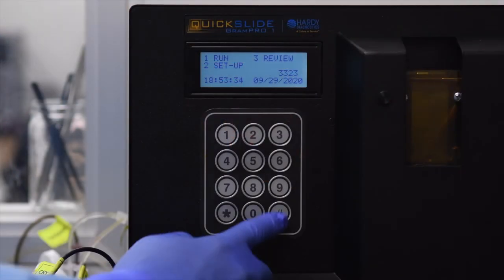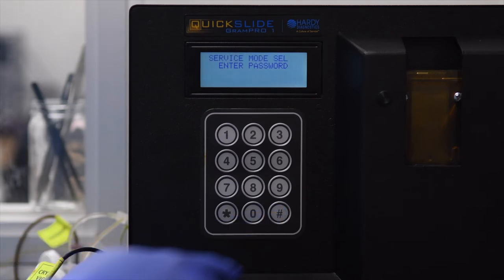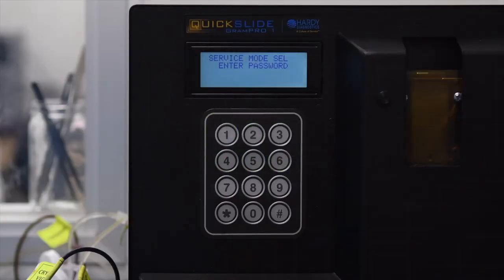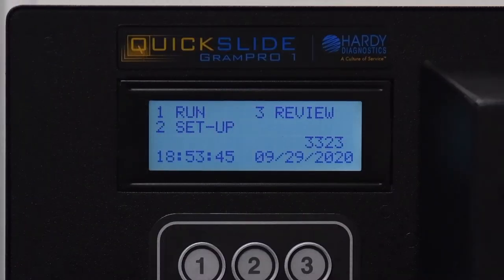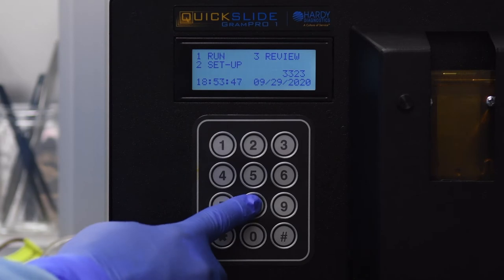From the main menu, press pound to select the password screen. Press 0 then press pound. A new screen prompting "Service mode selected - enter password" will appear. On this screen, press the keys 7, 5, 9, 0 in succession. Doing so correctly will take you back to the main menu.